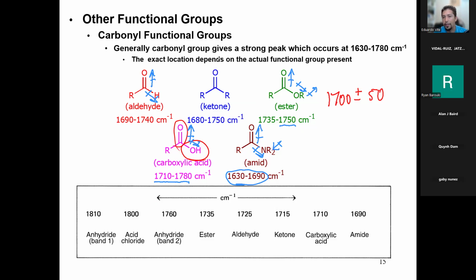And then you have the plain old regular ketone. So this is a common mistake. People call a carbonyl and they'll just say ketone. No. A ketone contains a carbonyl, but so do other things. A carbonyl by itself is not a ketone. Do not call it a ketone. It's a carbonyl. That is wrong. That will cost you points. So be very specific. First name, last name. I am carbonyl from amide. I am carbonyl of carboxylic acid. I am carbonyl of ketone. First name, last name, vice versa.